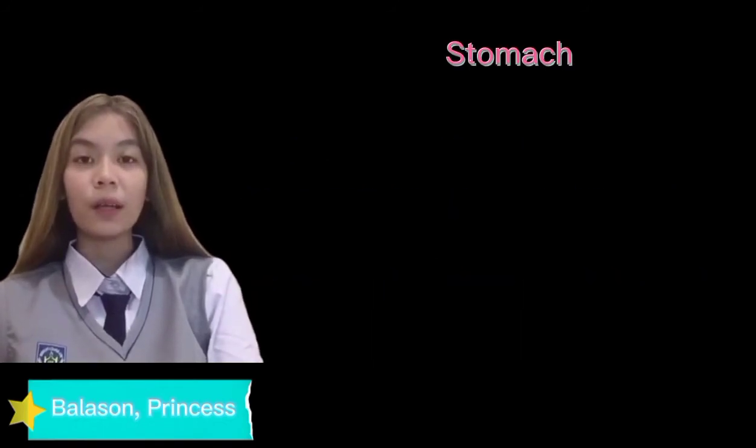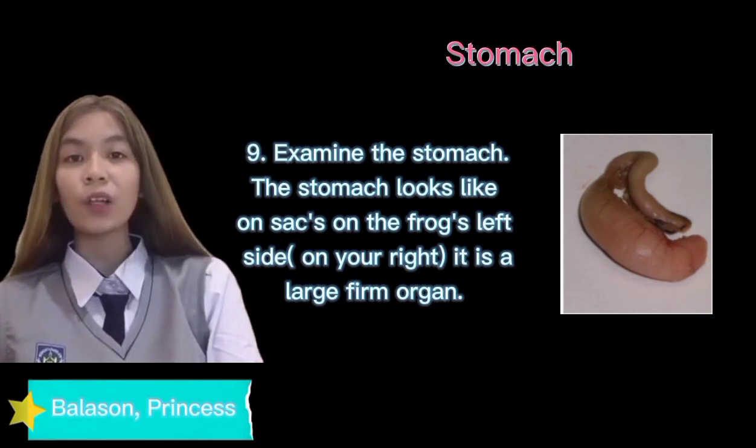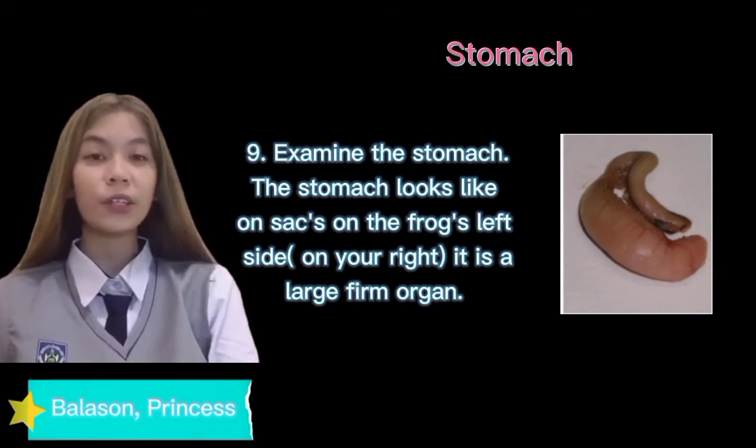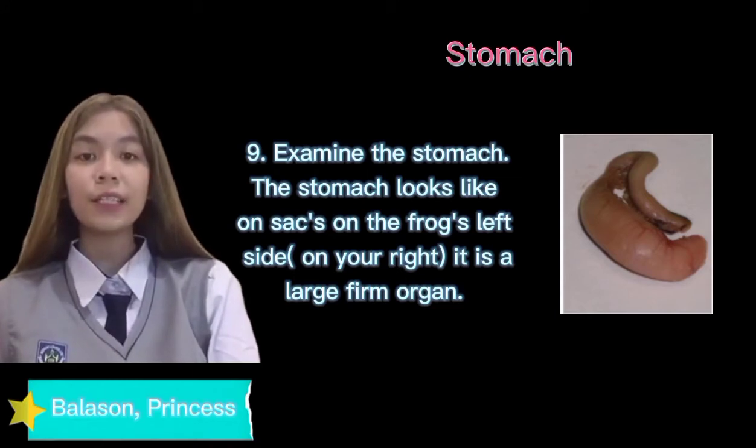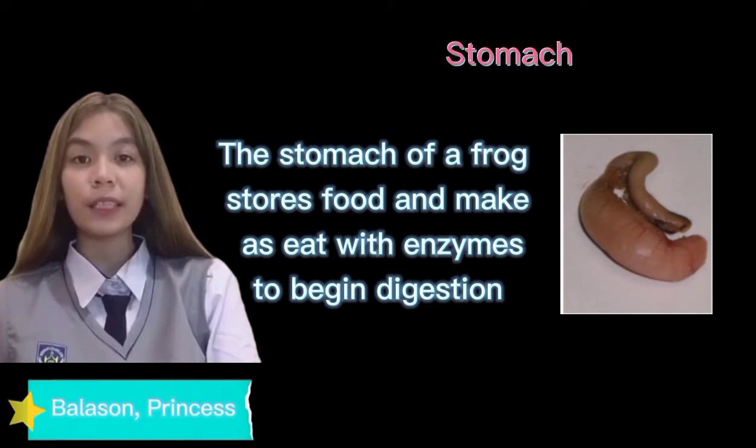Next is the stomach. Examine the stomach. The stomach looks like a sac on the frog's left side, which is on your right. It is a large firm organ. The stomach of a frog stores food and mixes it with enzymes to begin digestion.